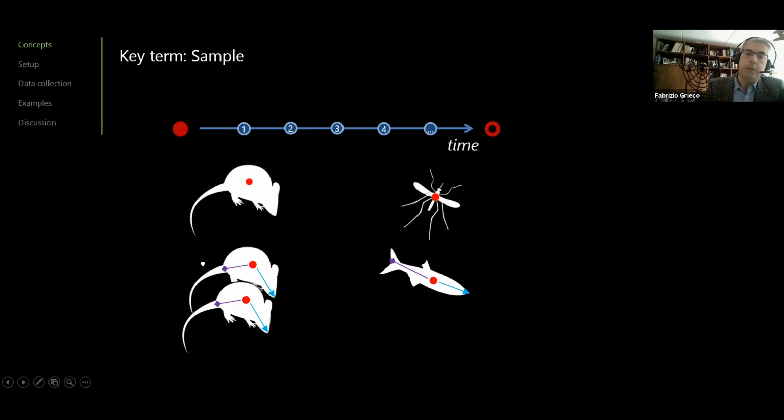That means that the sample itself contains 2 sets of coordinates of body points. So it's crucial when you make your JavaScript code to know exactly which feature you are going to extract from the raw data. There is more.